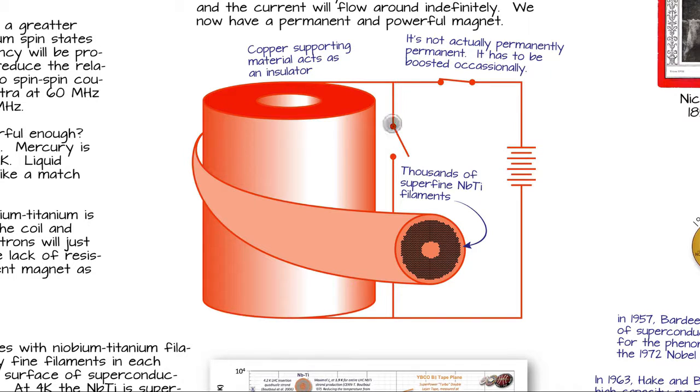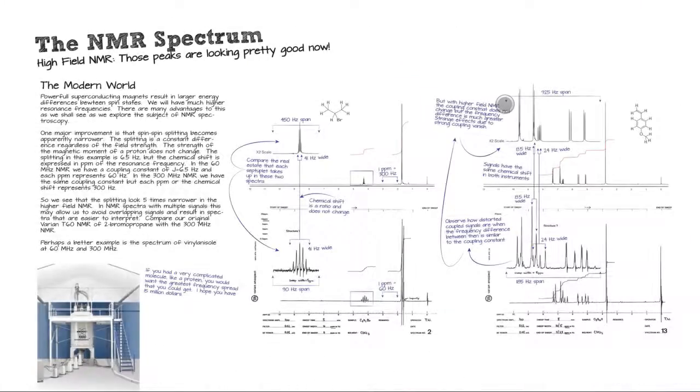So the current's going to go through those coils, back up here, back through the coils, back up here, back through the coils. And so now, without the battery source hooked up, the current is just flowing in there, nothing influencing it. It just evens out, spreads out, and it's just spinning around there, making a superconducting magnet, and it creates a nice homogeneous magnetic field, not influenced by any frequencies from your power source. So that's how you might construct a superconducting magnet.